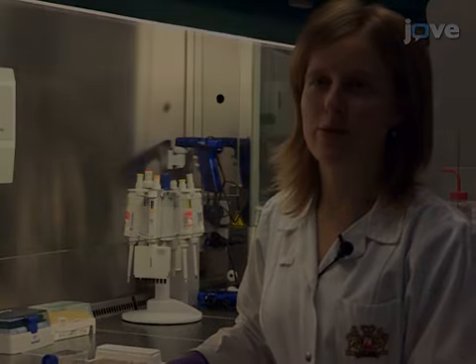Once the cells are seeded, it's very important to leave the plate at room temperature for 40 minutes.